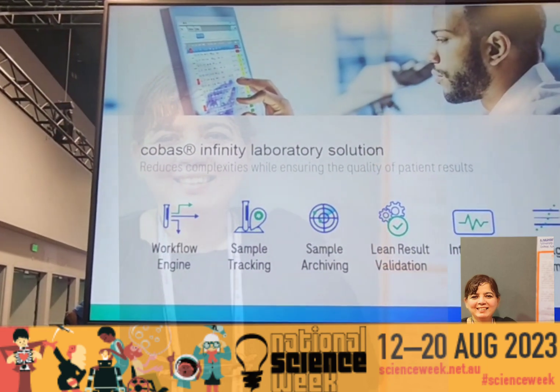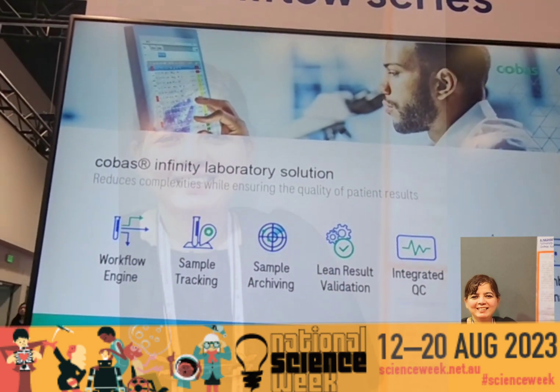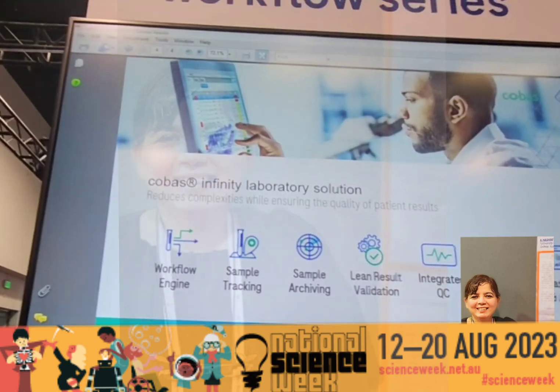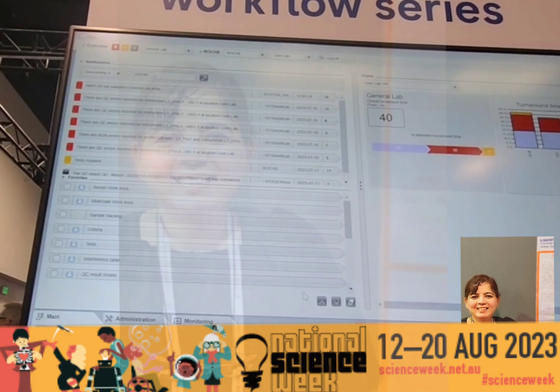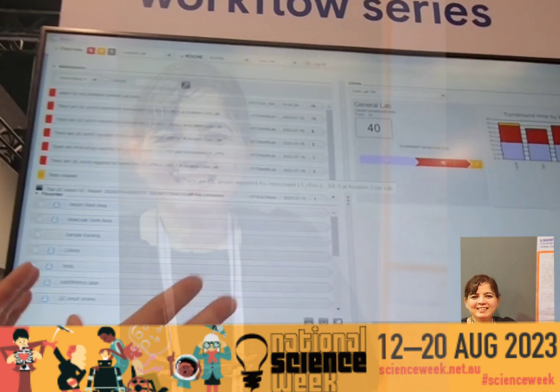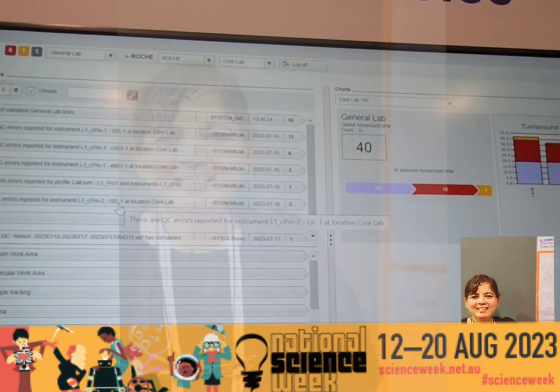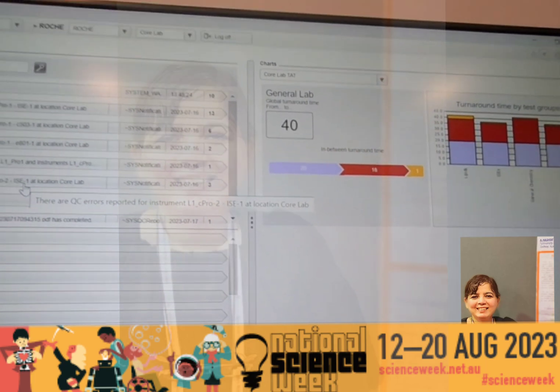Executive level reporting and understanding — and jumping from that into the user interface, this is where a user would expect to land when you log in for your daily routine.